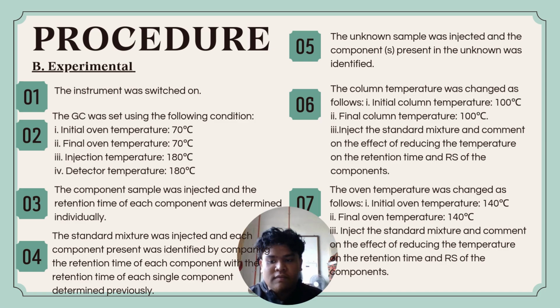7. The oven temperature was changed as follows. First, initial oven temperature 140 degrees Celsius. Second, final oven temperature 140 degrees Celsius. Third, inject the standard mixture and comment on the effect of reducing the temperature on the retention time and resolution of the component.